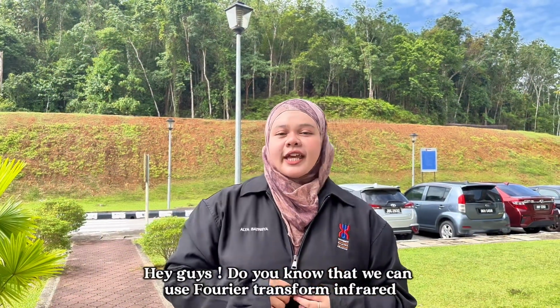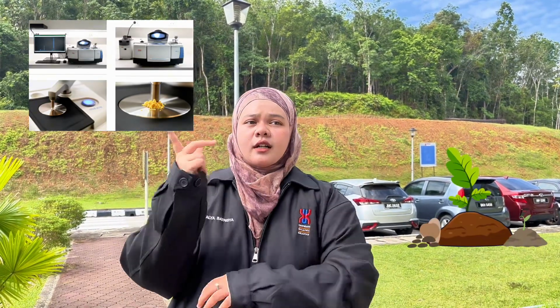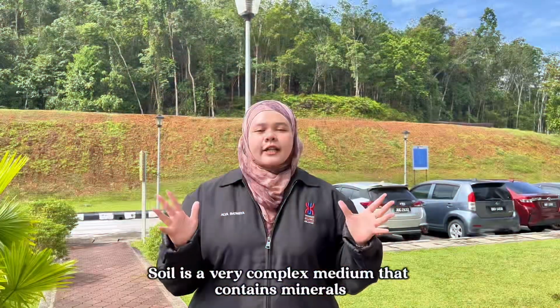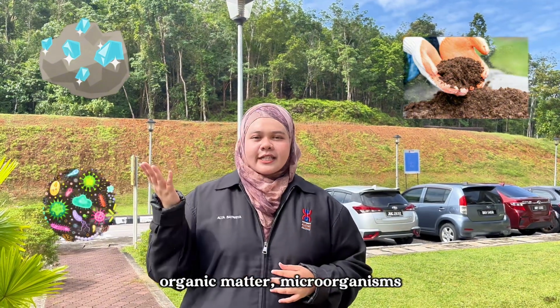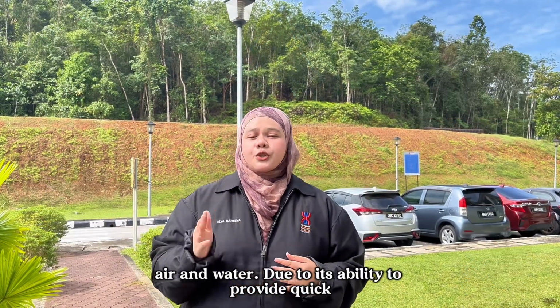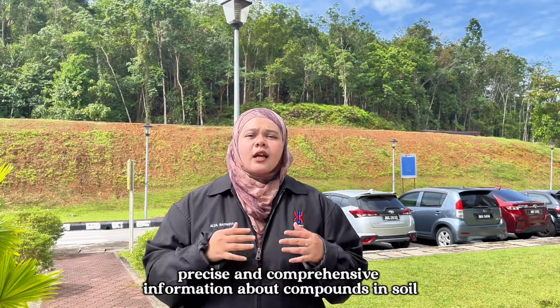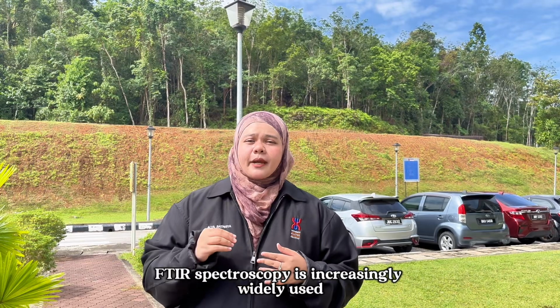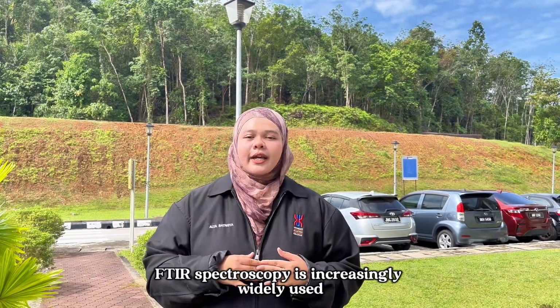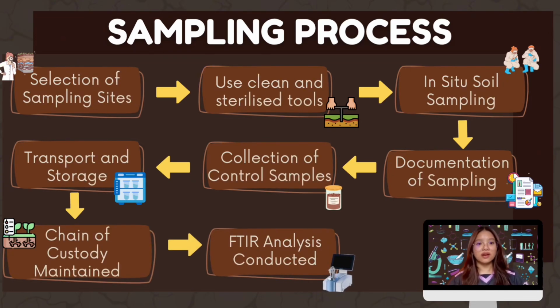Guys, do you know that we can use Fourier transform infrared (FTIR) spectroscopy to analyze our soil? Let's find out. Soil is a very complex medium that contains minerals, organic matter, microorganisms, air, and water. Due to its ability to provide quick, precise, and comprehensive information about compounds in soil, FTIR spectroscopy is increasingly widely used.